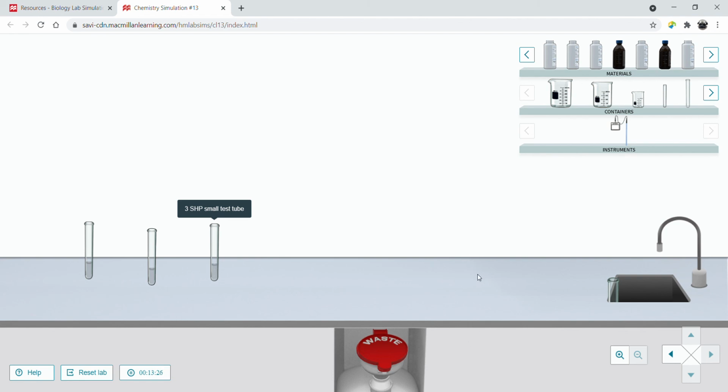And then what we're going to do is take the pH of each of these, and you want to record this in table 2. So we haven't added the hydrochloric acid yet. Take the pH, and in the second column on table 2, you want to record the pHs that you're going to see. All right, so here is our pH.